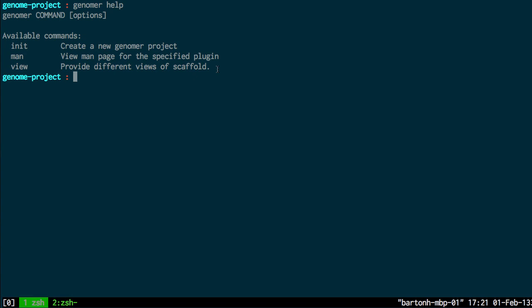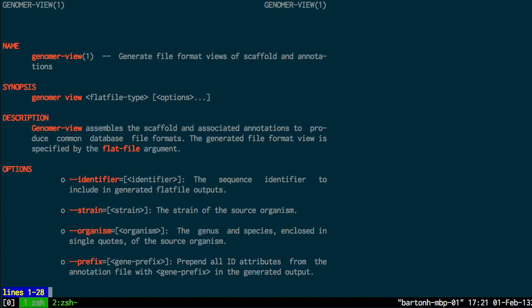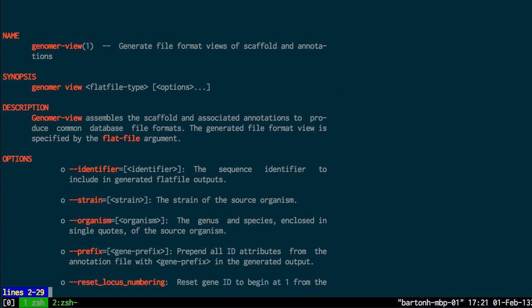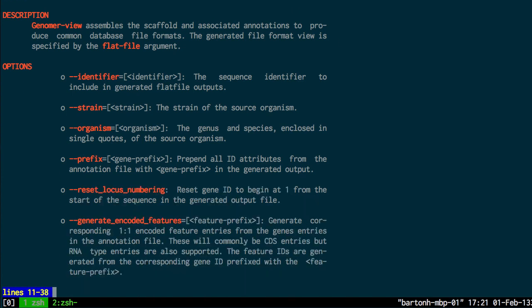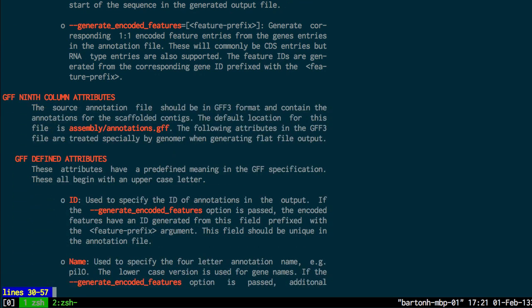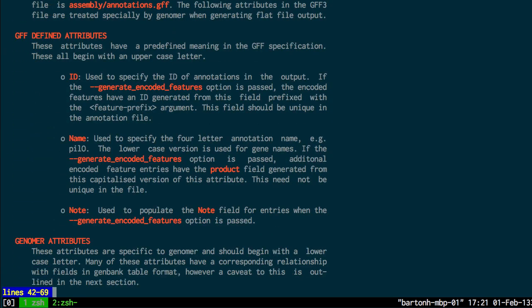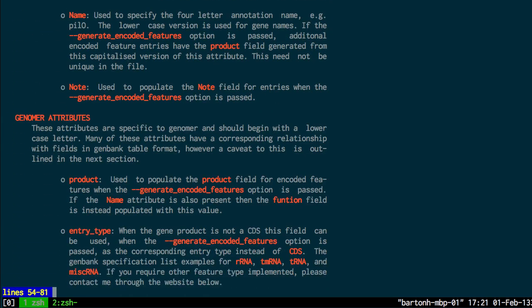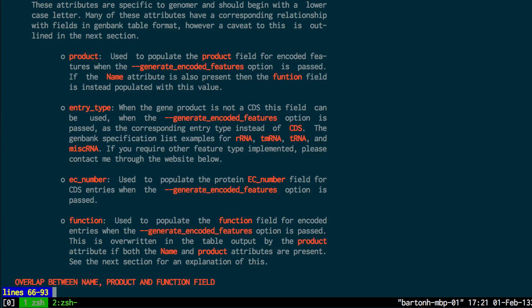And every command I have written has a man page. So if I do Genoma man view, it is the man page for generating different file format views of the scaffold and the scaffold annotations. And it's a standard man page with the file options and descriptions of how the options should be specified.